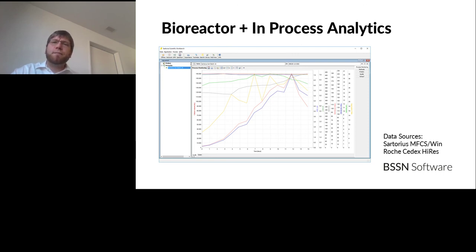And you can add your external analytics data too. So if you have HPLC data or SDS page or Western blots, or so, they can go into the same AnIML document, and you get a great reuse of the tools. And to me, that is also lab of the future. So those were a couple of examples of the data packages you can then actually generate if you follow that integration approach. And you can mix and match.